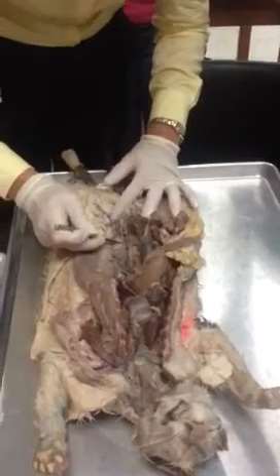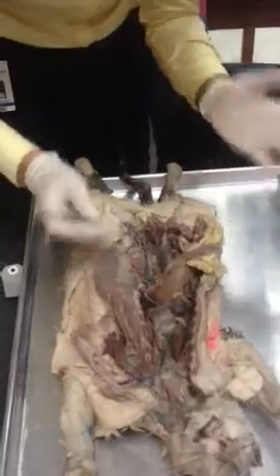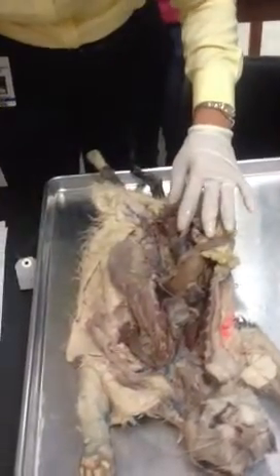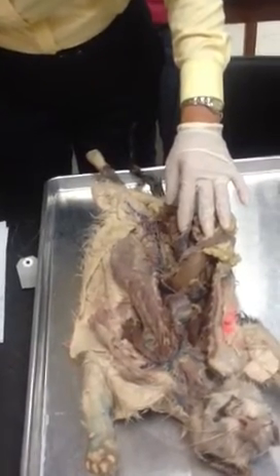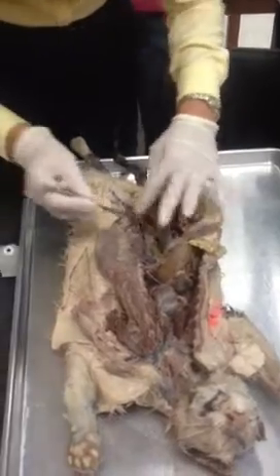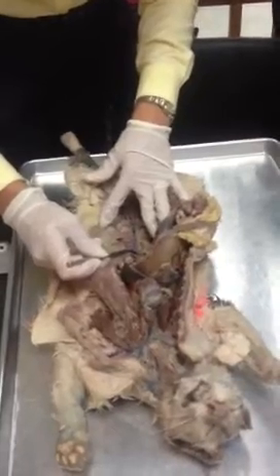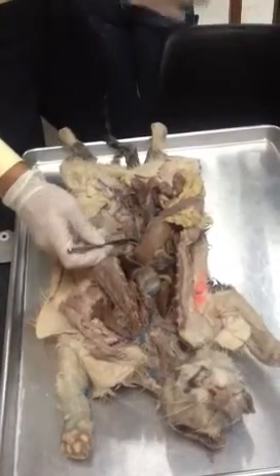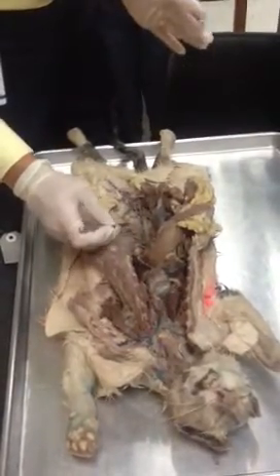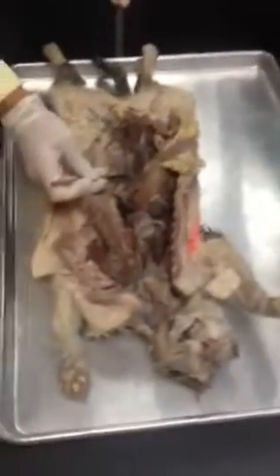Now, here we have again a lumbar vein, right, parallel with what I call lumbar artery, but I believe in cat it is somewhat differently. Then we have here obviously large renal vein, and now the renal vein on the left side, we should have that the gonadal vein plus the suprarenal vein will flow into the renal vein, and the renal vein will bring the blood into the inferior vena cava.